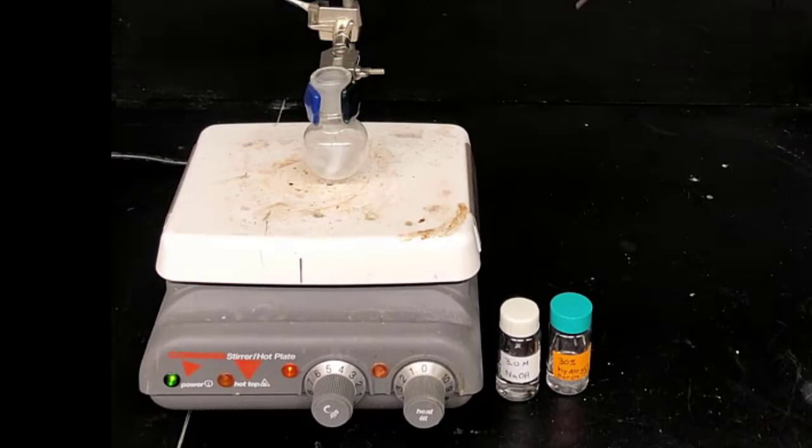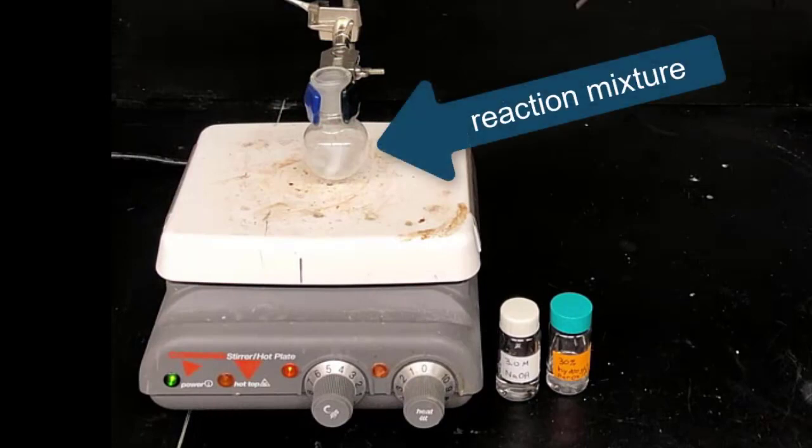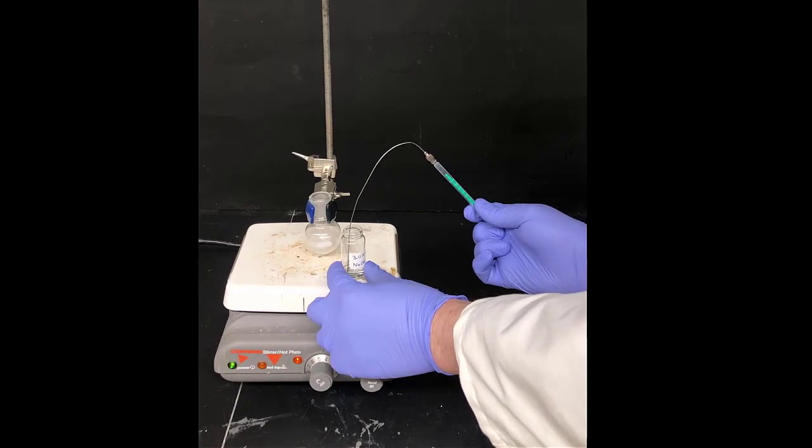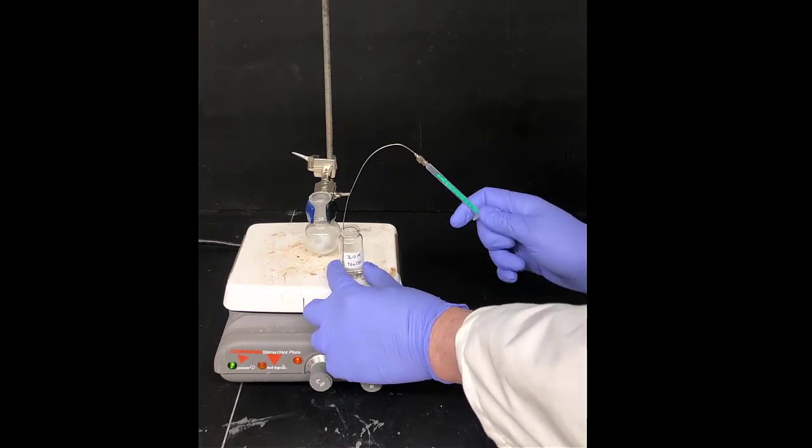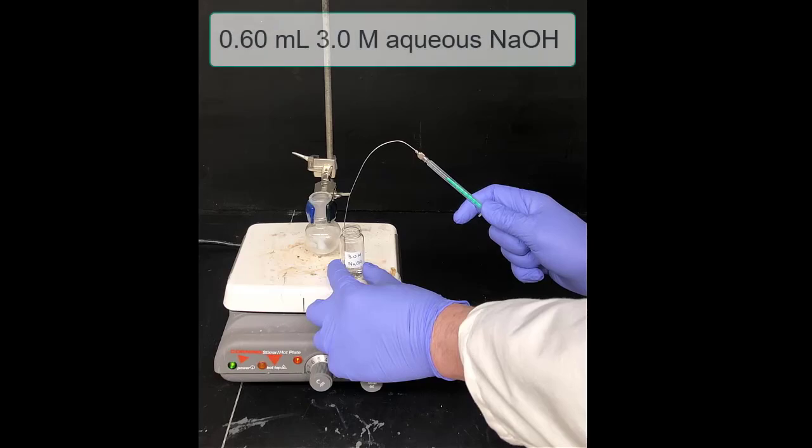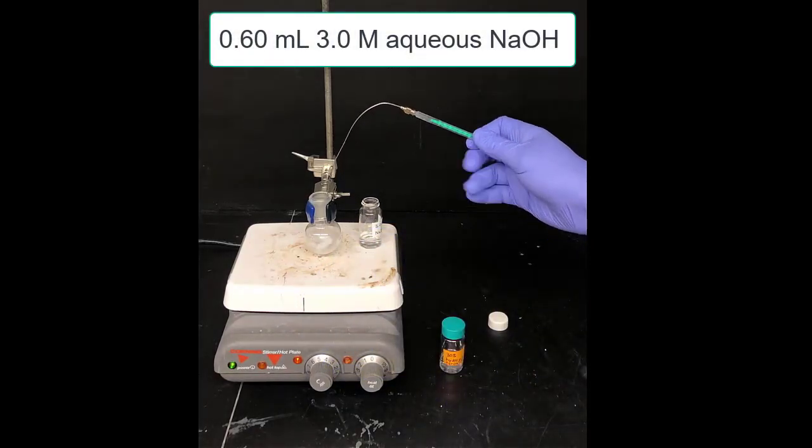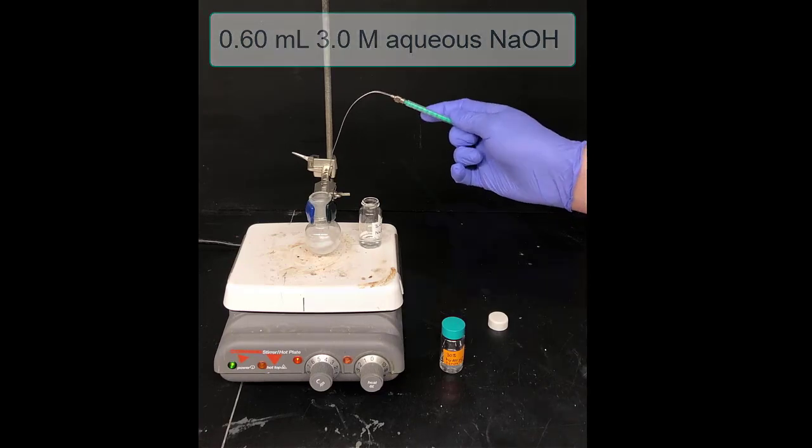Your reaction mixture from last week contains THF and the product mixture in a round bottom flask. You should put a stir bar in your round bottom flask, put that on a stir plate, and get that stirring. Then, we'll dispense the sodium hydroxide reagent using a one milliliter syringe and stainless steel needle. Withdraw 0.60 milliliters of this reagent and then inject that into the reaction mixture with stirring.